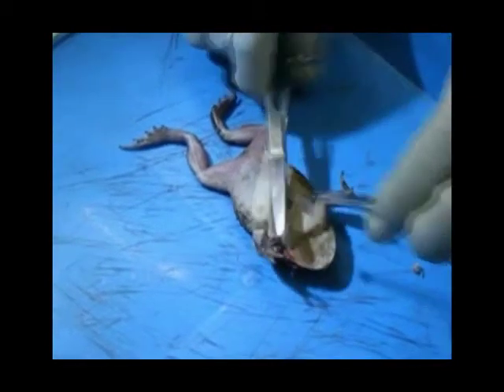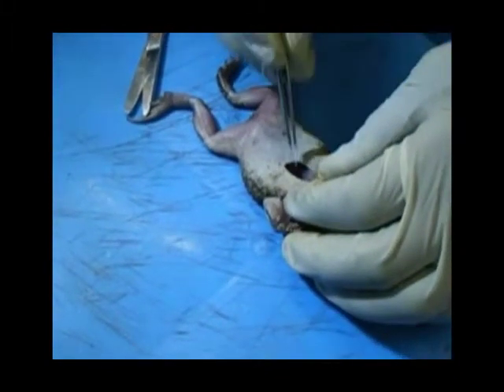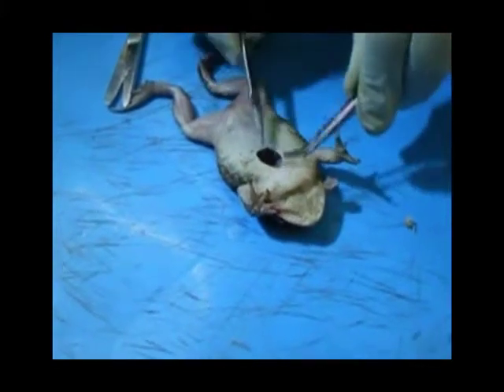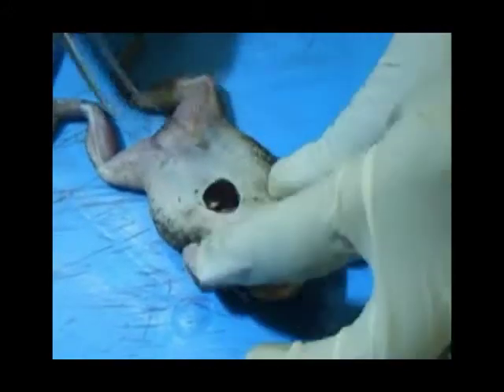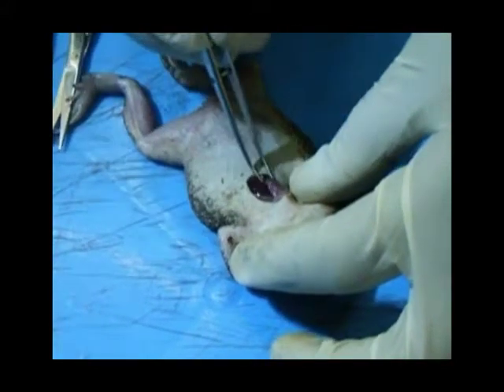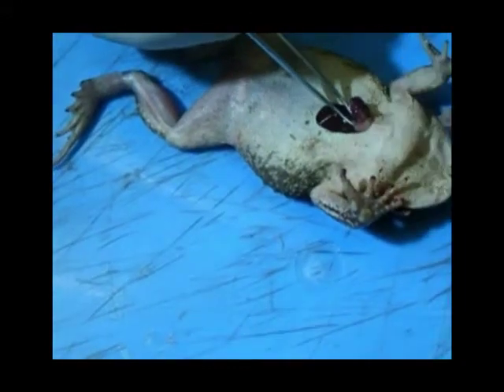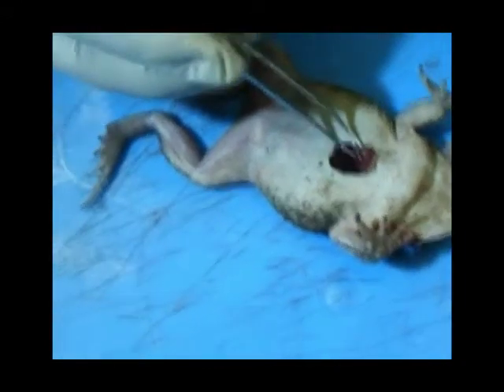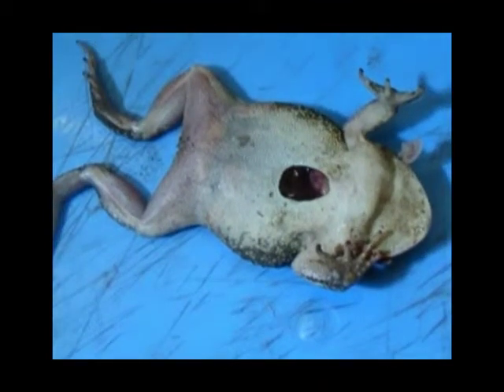The exposed xiphisternum is then removed, creating a window in the body wall allowing the heart to be seen. The pericardium surrounding the heart is cut away and the heart exposed.